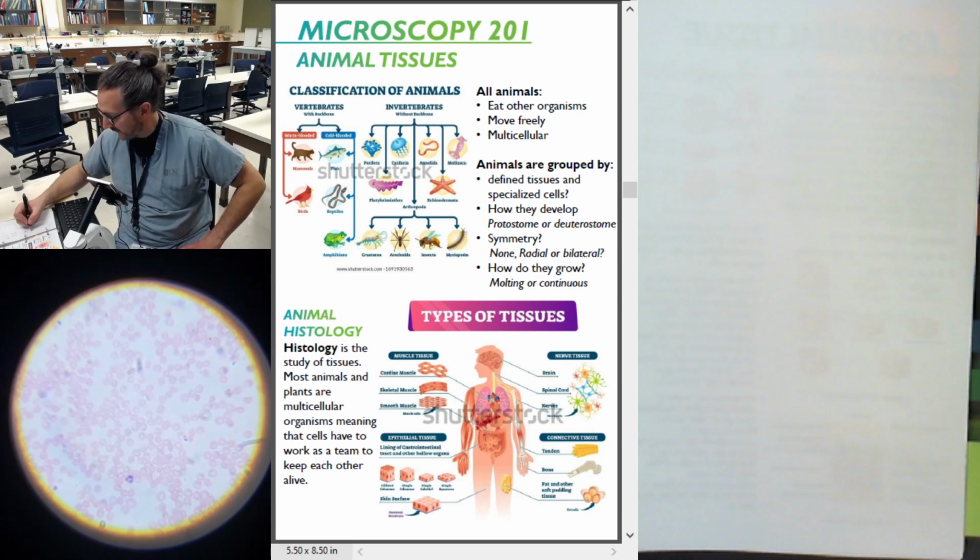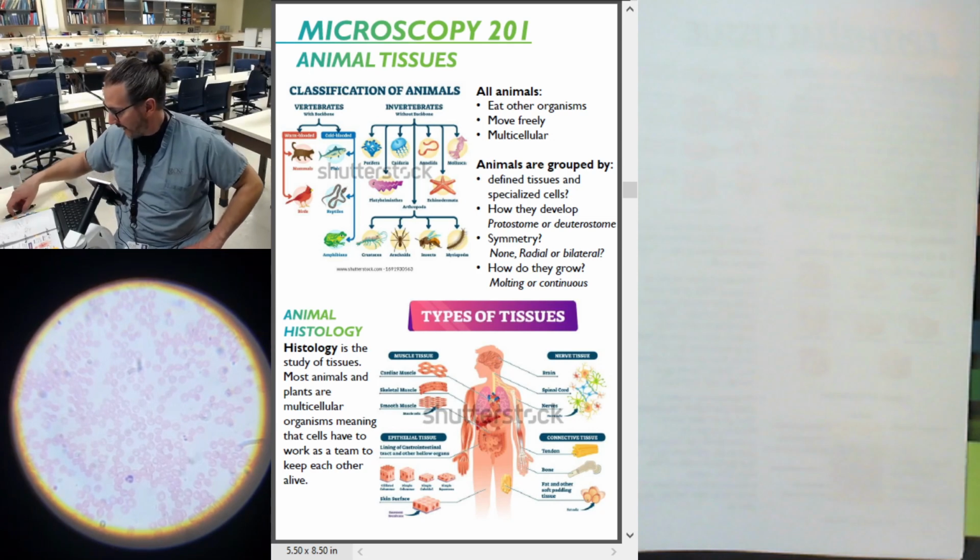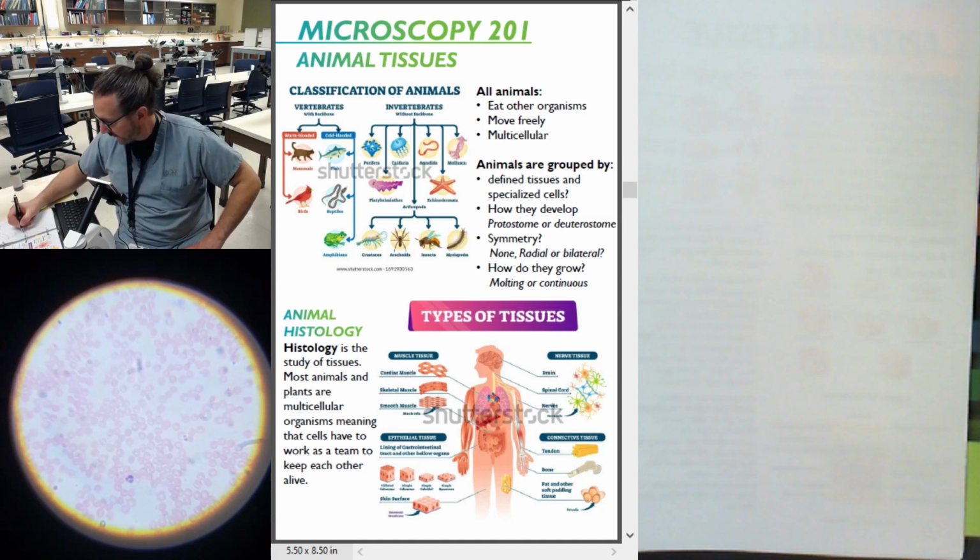Poly means many. Morpho means shape, if you remember when we talked about bacteria. Nucleo means, well, nucleus. Cyte means cell. This is a cell with a nucleus that's shaped in many ways. So they have really oddball shapes. And that one is most likely a neutrophil.